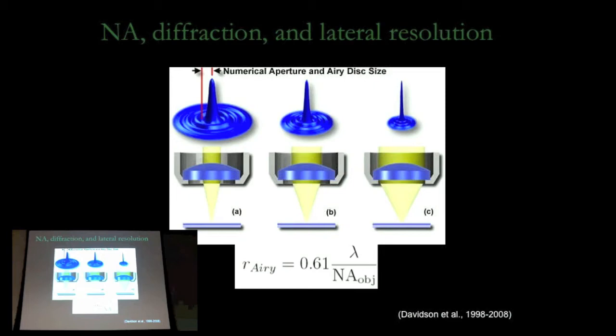Yes. In the first image, do you think that's actual reality? Because in real imaging, that band of light is only narrow at the center of the lens, in the first image, right? It should all be collected by the whole lens, right? Instead of just the center of the lens. It's basically showing it backwards. If you're projecting a column of light from the back aperture, it's going to get focused down to a point like that. But the diagram is a little off.